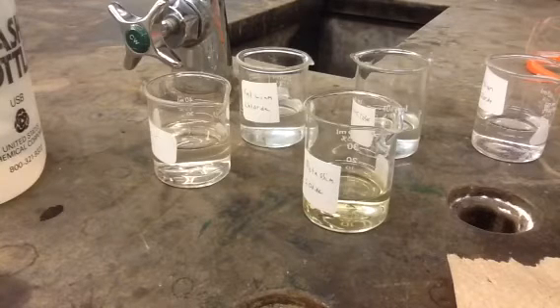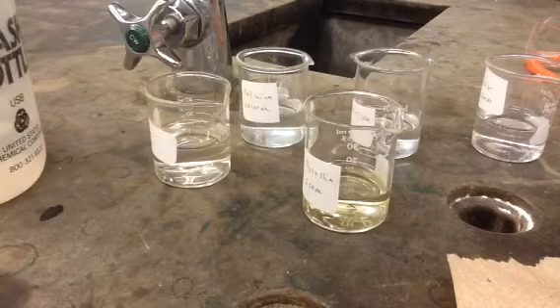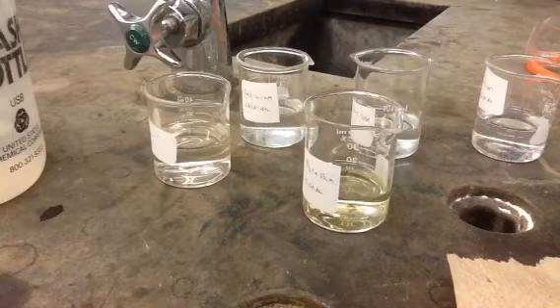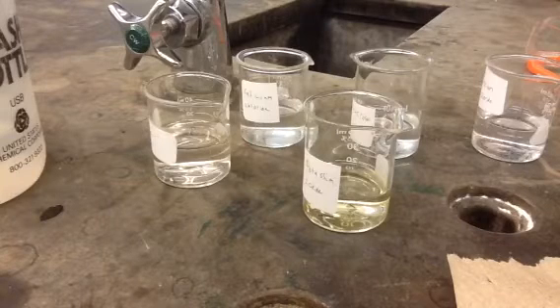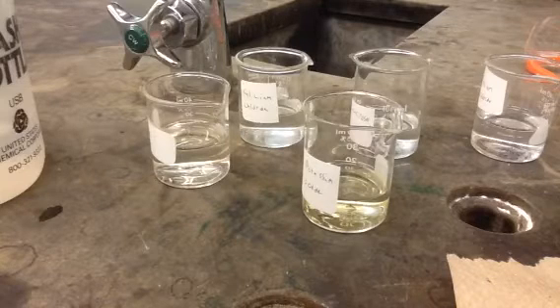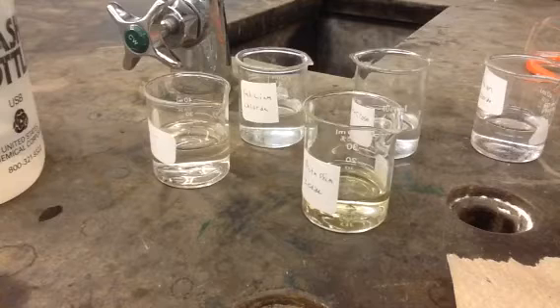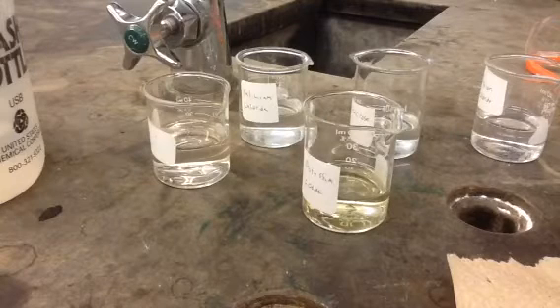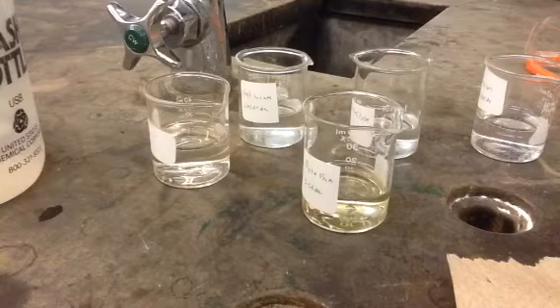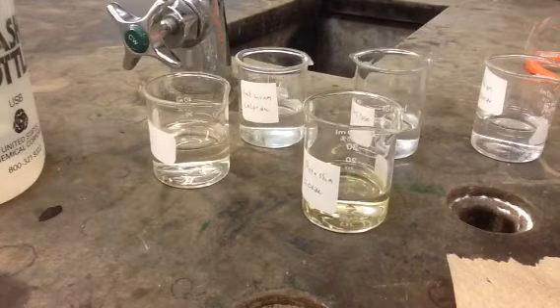Now, lakes, rivers, streams, ponds are nothing like pure water. They got all kinds of other stuff in them. Fish pee, goose poop, runoff from the land, all kinds of things. And different chemicals in solution have different levels of solubility. So we got 3 here that seem to be conductive, and 3 that are not. Well, one of those 3 is like, you get little bits of current through.